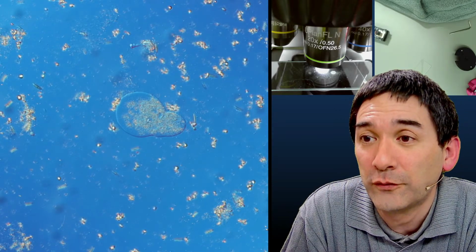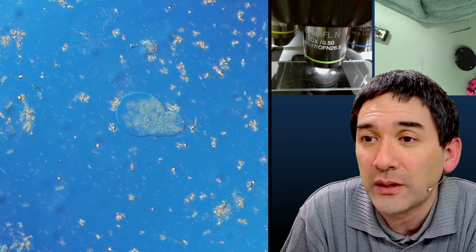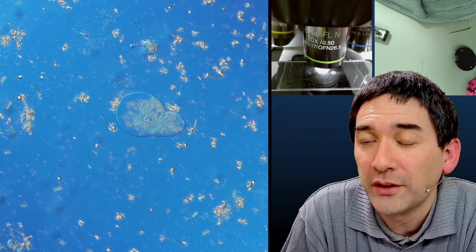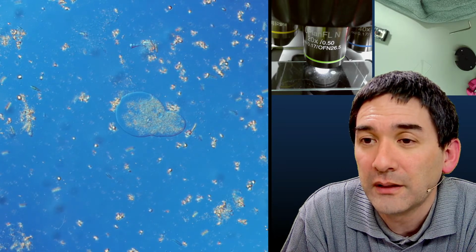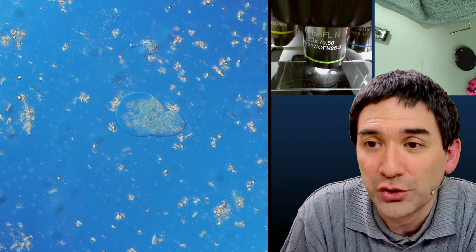There's a few ways to look for spores. One, spore prints and gill sections. That way you can show how they attach to the gill. Yep. I was going to cut the cap off and make a spore print directly onto the slide and try that. That's also possible.